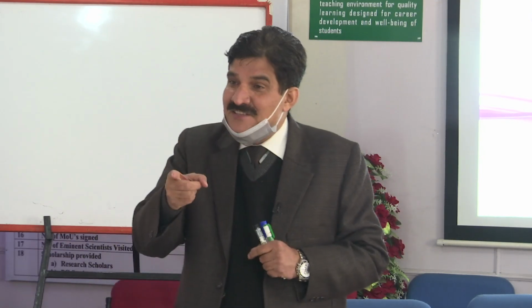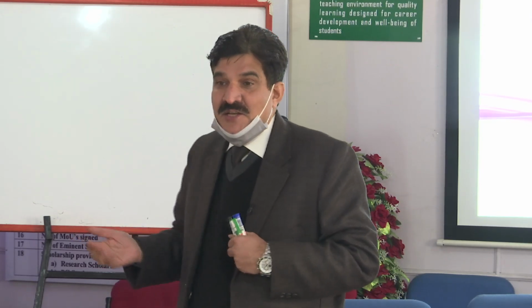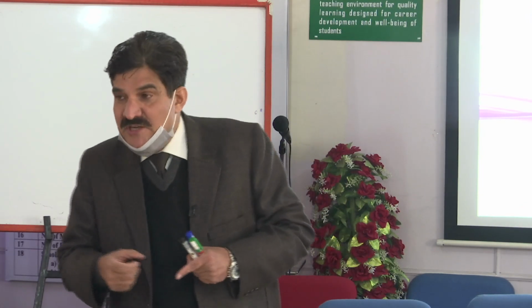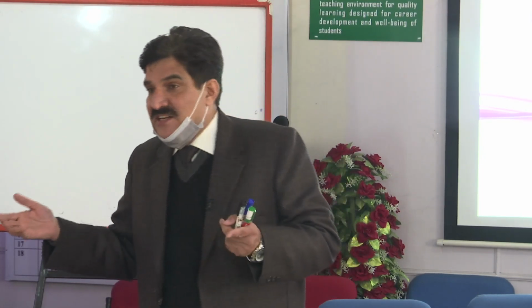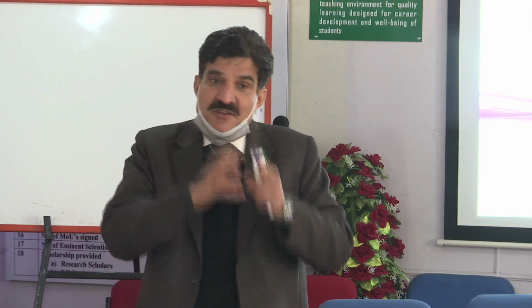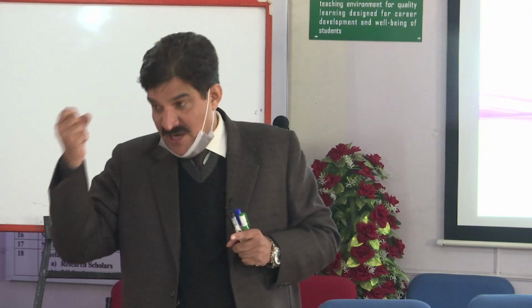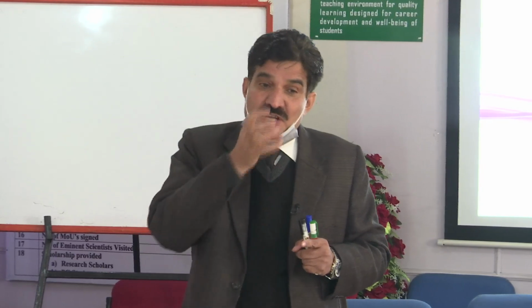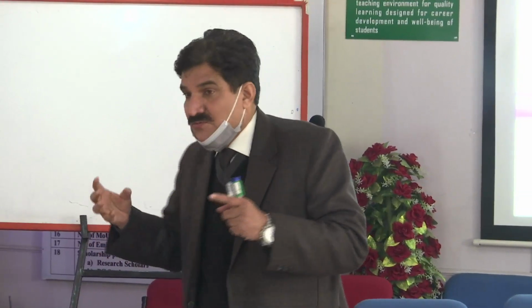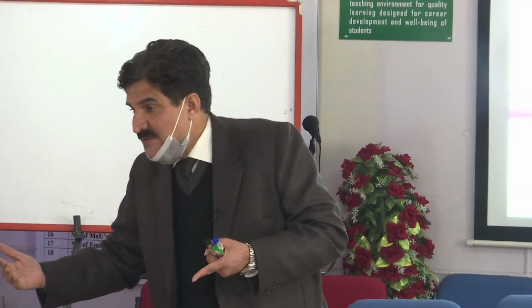Like in the case of plants, you usually take the detergent CTAB, not SDS, because CTAB is a detergent with positive charge, cetyltrimethyl ammonium bromide, hexadecyl and so on. That means it is a positively charged detergent. It has a role because plant cells contain a lot of carbohydrates, polysaccharides as you know. In order to get rid of such polysaccharides, at a particular sodium chloride salt concentration one thing is precipitated out while another remains in soluble form.